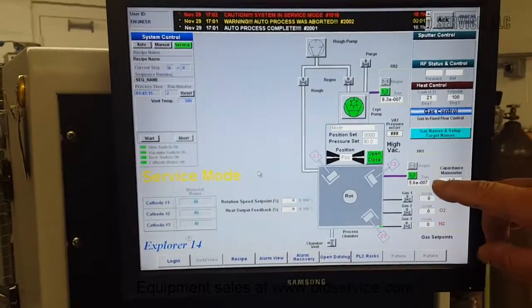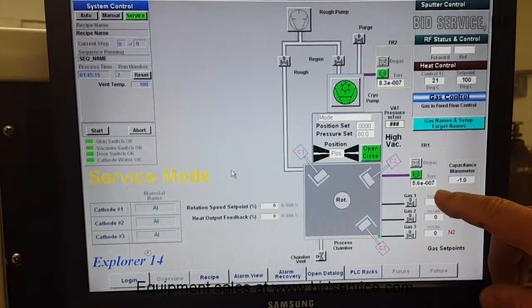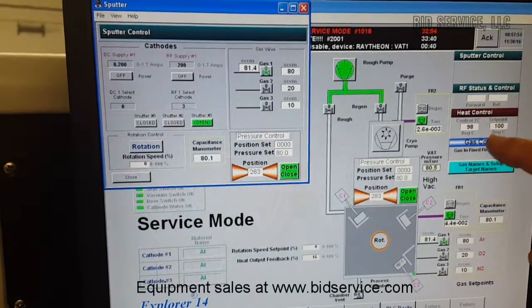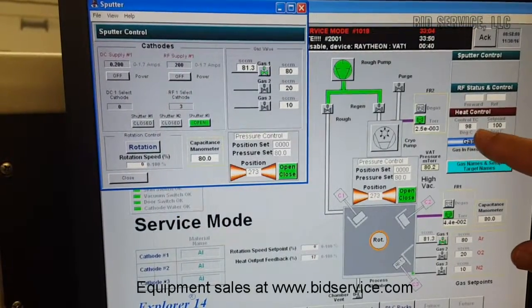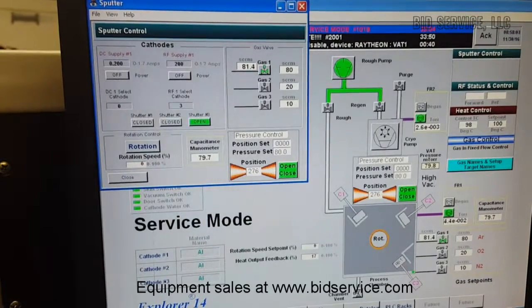Just want to show you the base pressure of the chamber right now — it's 5.6 in the 10^-7 range. Let me show you a couple of things on the screen. Right here at the heat control, we have it set for 100 degrees and that's at 98. Every time you look in the chamber, you're going to see the lamps turn on and off — that regulates the heat.